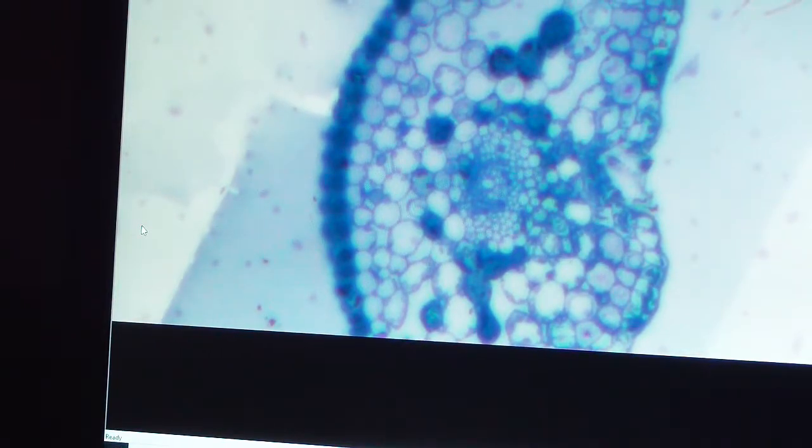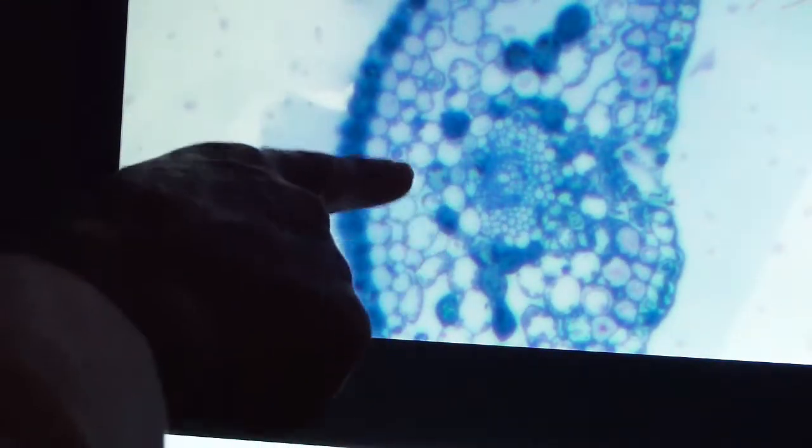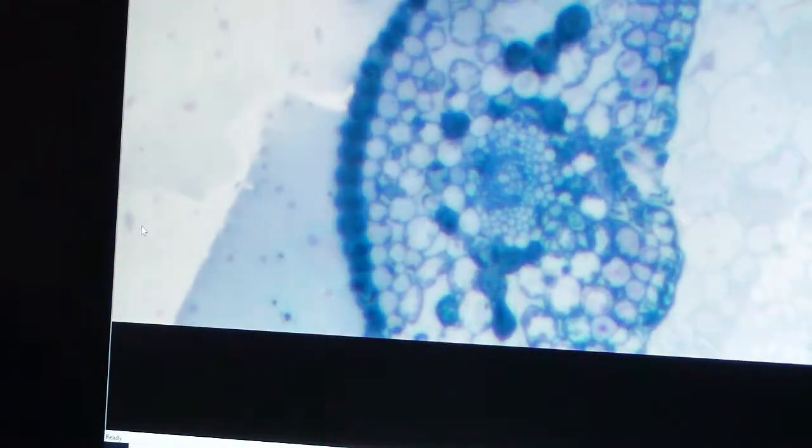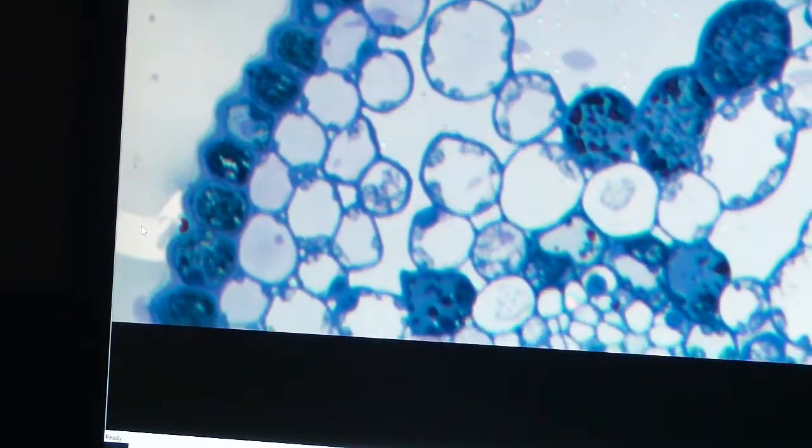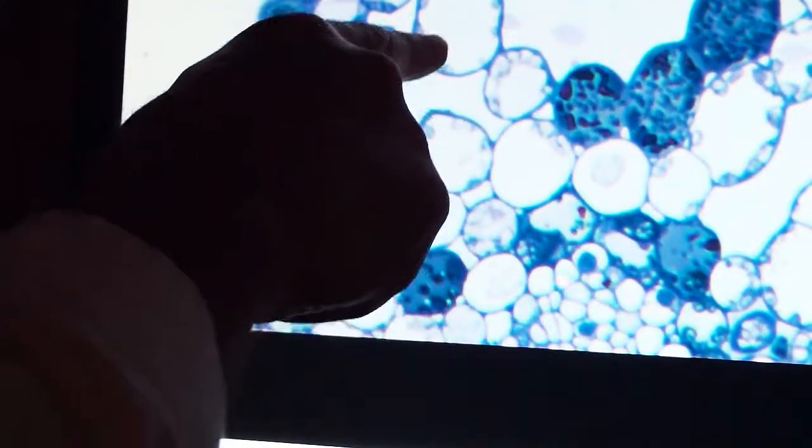So here's the euonymus plant, and this was a difficult one in that it's got a very waxy coating on the top and the bottom to inhibit potential infiltration. Now as I look at this, the upper epithelium and lower epithelium all look good, but the inner part does not look like it's infiltrated. And I need to look at the thick section to really get a good idea of what that is, whether it is or not. And in looking at the thick section, even though my camera got tilted, sorry, I can see that the sample is perfectly well infiltrated. Both the upper epithelium, all of the vascular bundle is intact. And then looking at the upper epithelium, I see one little void there. But the chloroplasts all look very good, even though they have starch in them, and that's usually a negative for plants.